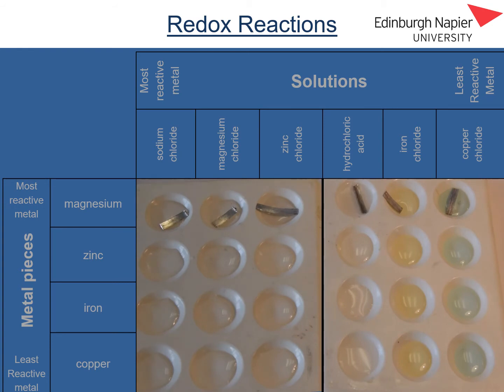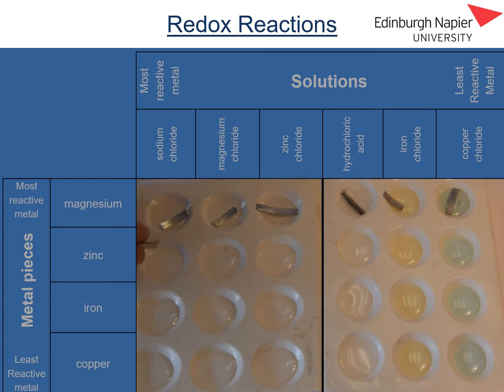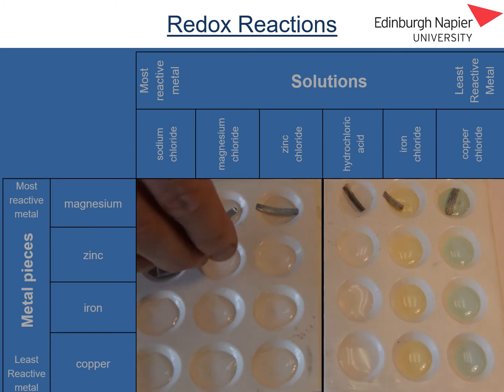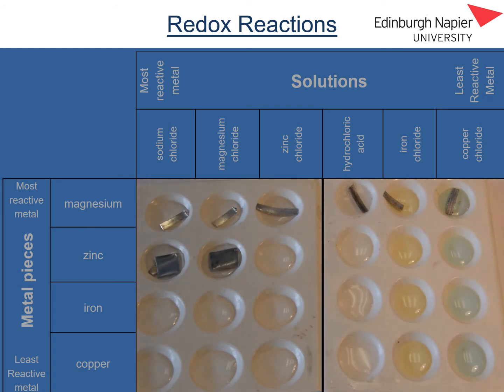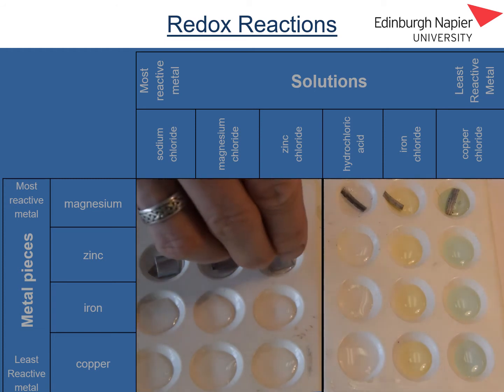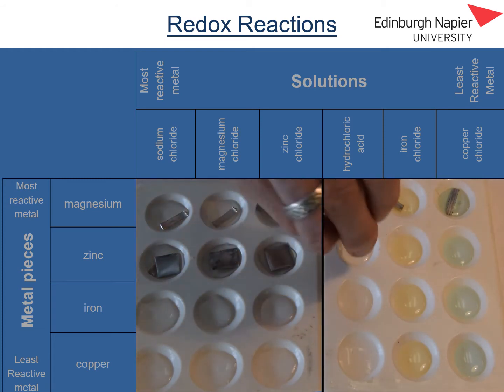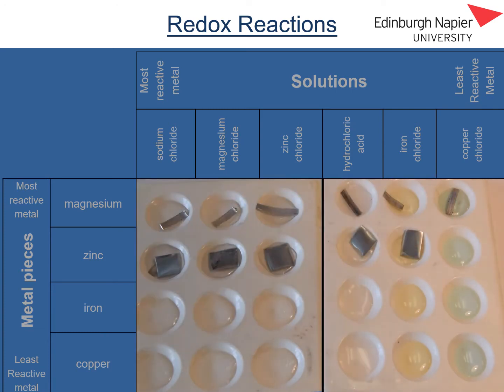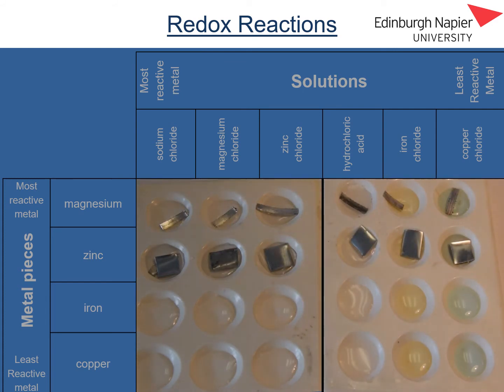Now to the next row down I'm going to add some pieces of zinc metal. A piece of zinc is being added to the sodium chloride solution, zinc to the magnesium chloride solution, to the zinc chloride solution, to the hydrochloric acid solution, to the iron chloride solution, and finally to the copper chloride solution.